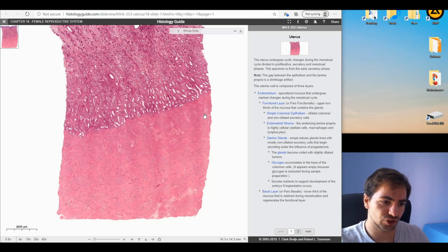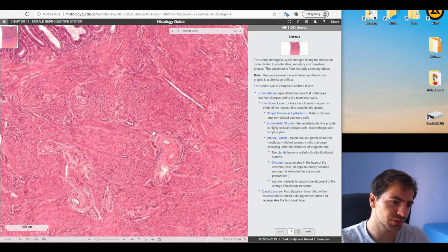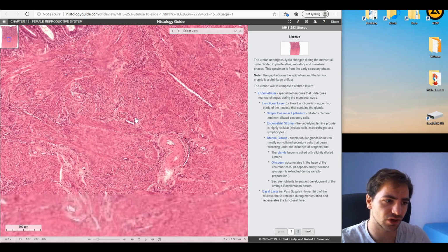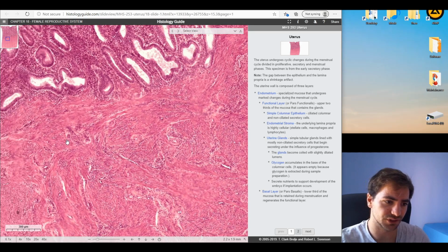Now the myometrium is going to be composed of 3 different layers. The first, the longitudinal layer, then the more circular or spiral one, and lastly again the longitudinal section. Now if we zoom in, we're not going to see exactly the typical feature. We're going to see a more complex structure, more overlapping structure with different features of different orientations. For example, this is the typical longitudinal section.